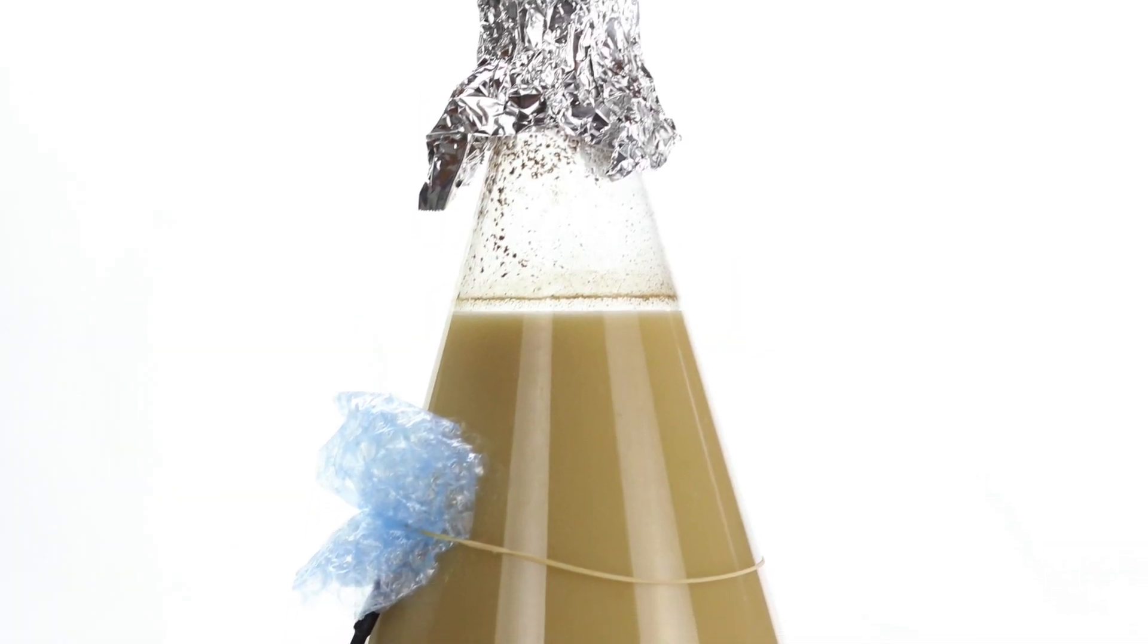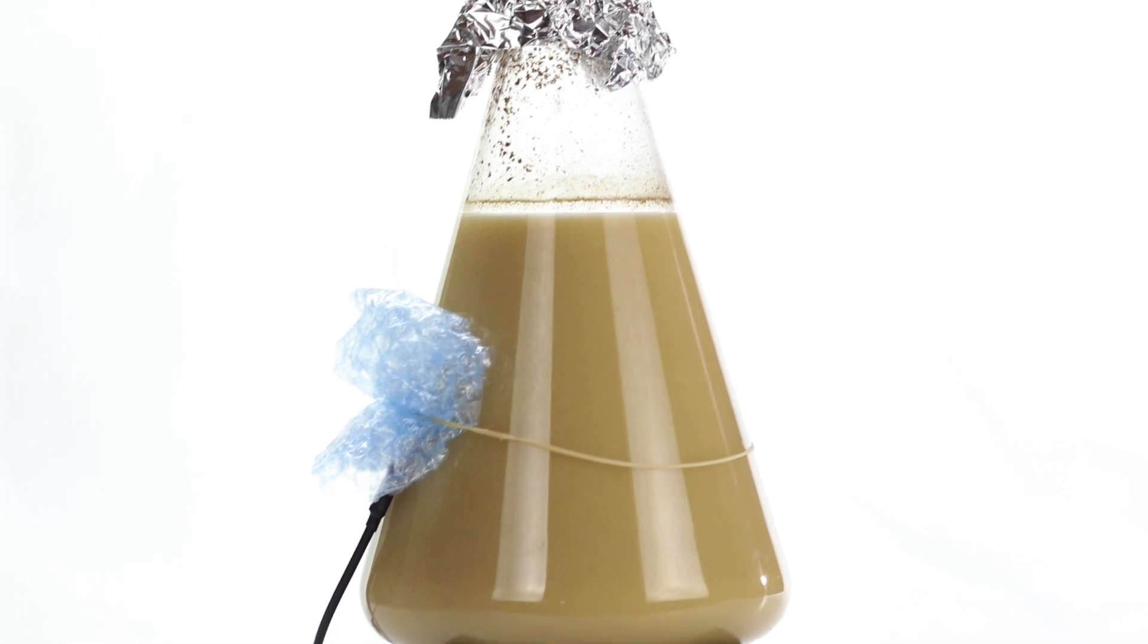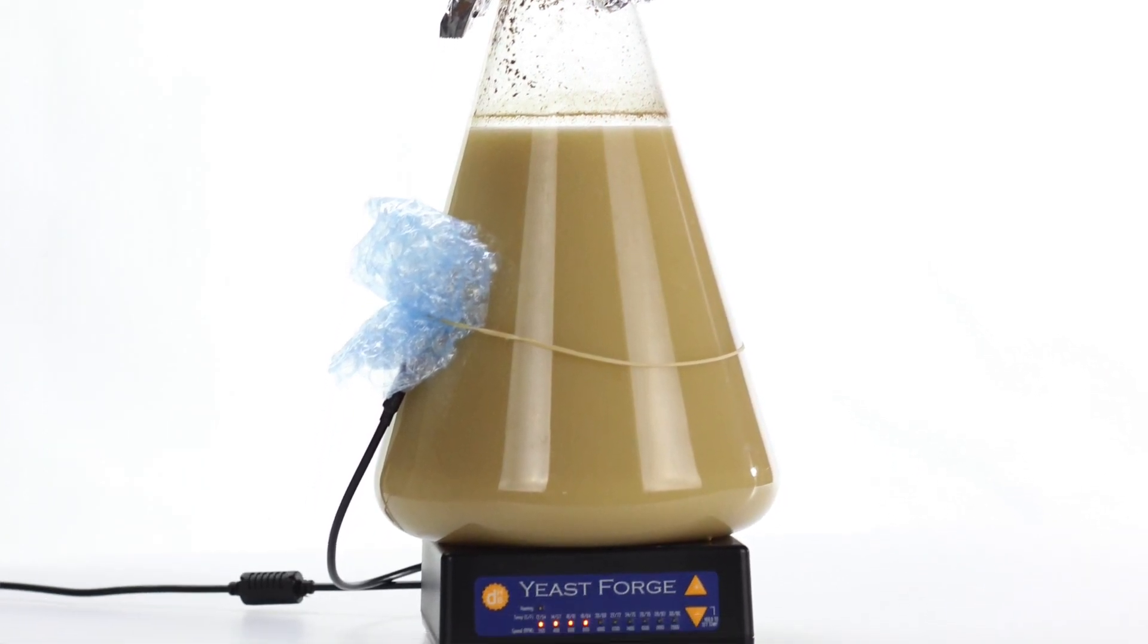Yeast Forge is a heated magnetic stirrer designed specifically for brewers to help you make more consistent and healthy yeast starters. So let's get started.